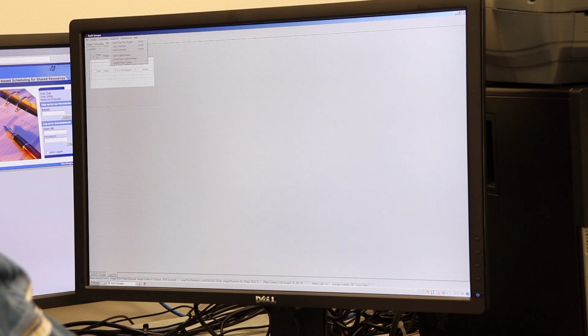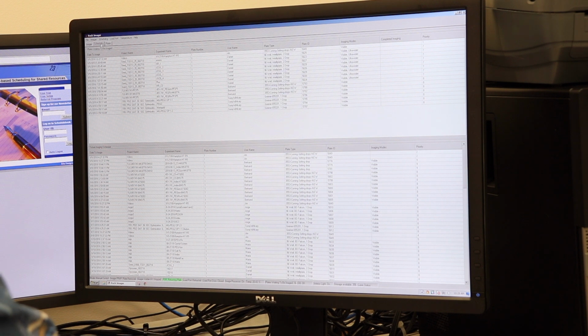Next thing you want to do is go up to Load Port and Store Contents. What that's going to do is the robot is going to come down to the Load Port Hotel, pick up the plate, and bring it into storage. Okay. So if we go to the Scheduling tab, we'll see that this particular plate is next in the schedule. The reason for that is we set it to image at 0 days, 0 hours, so that's now. So it's going to take the first plate and begin to image it.